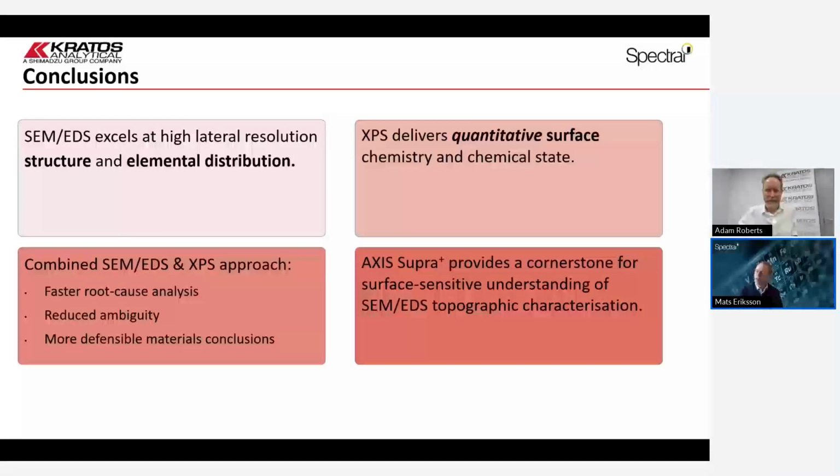On the SEM side, I talked about that detector with a larger solid angle. That is an annular detector, and it would collect a symmetric EDS map, with very limited shadowing. So going for that kind of EDS detector would help, or in some configurations we have more than one EDS detector, one from each side, and then topography is more or less cancelled out in that measurement. So that's another way of approaching that, I think. No, but good.